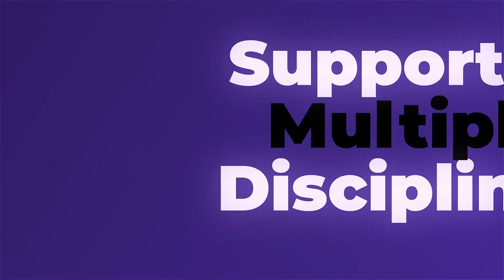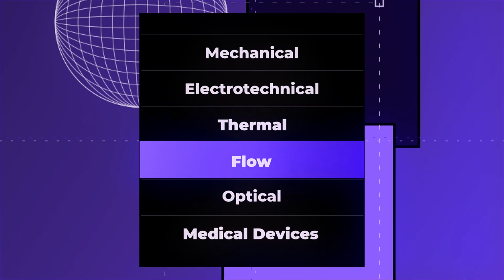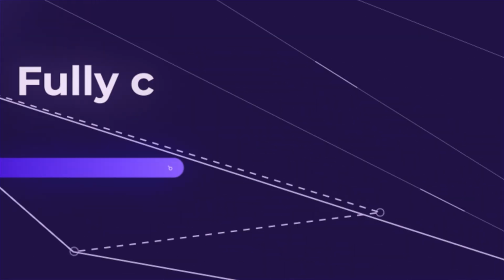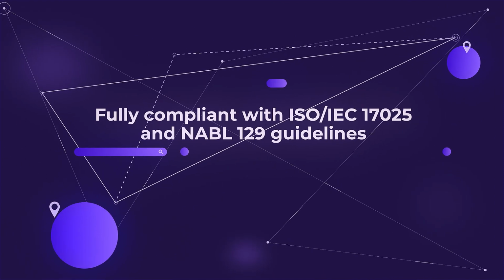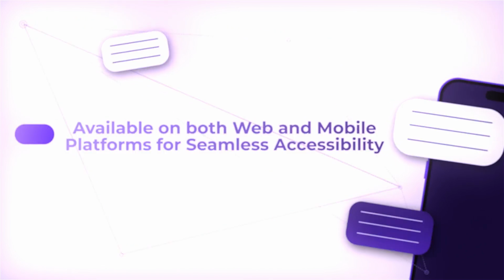The system supports multiple disciplines such as mechanical, electrotechnical, thermal, flow, optical, and medical devices, along with their subgroups. Fully compliant with ISO/IEC 17025 and NABL 129 guidelines, our solution is available on both web and mobile platforms for seamless accessibility.